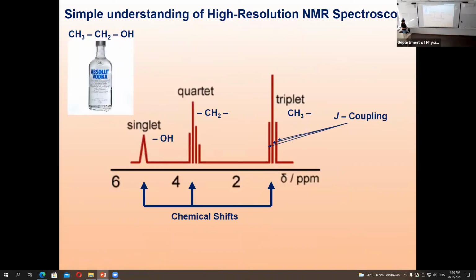Well, if you take a simple liquid, it has 3 different chemical groups. They are different because they have different structures of electron clouds. And this structure of electron clouds is influenced by the magnetic field and produces the shielding. And the shielding is called chemical shift.